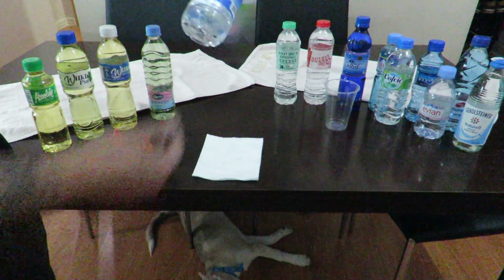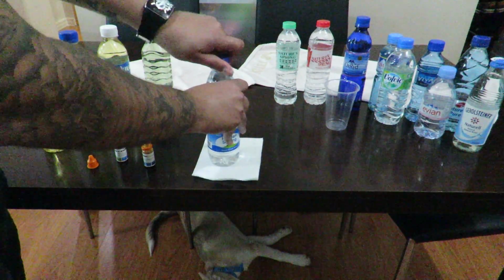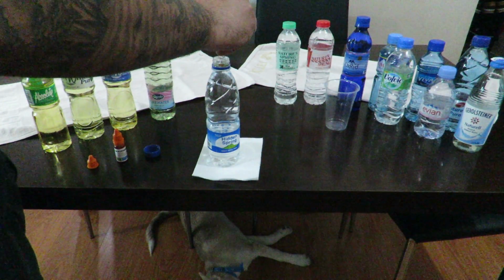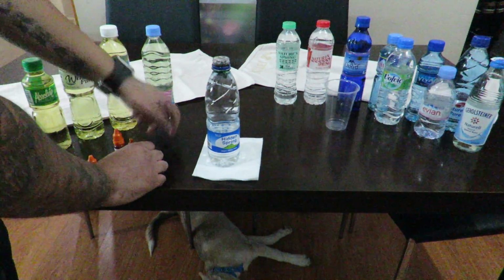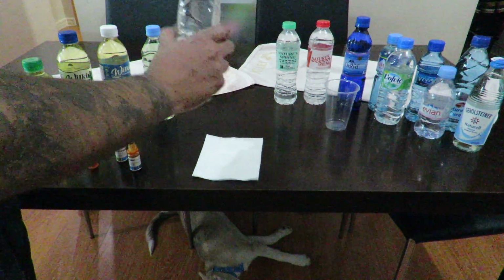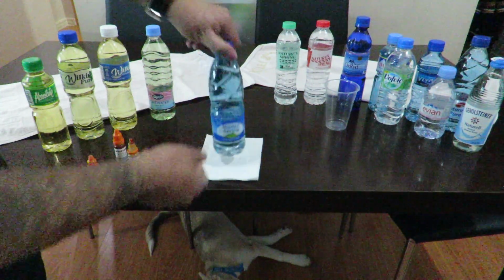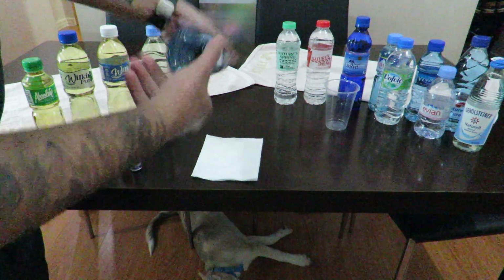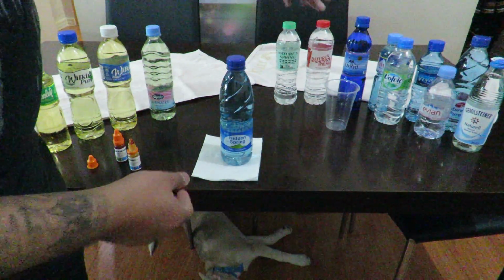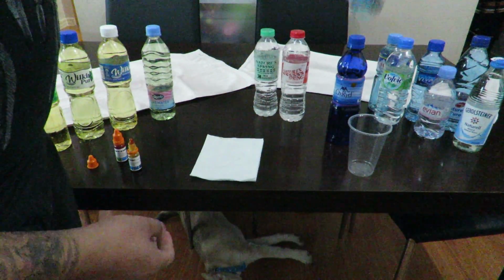And then our next is called Hidden Springs. It's a natural mineral water. Put some drops in. Obviously mineral water is better to drink than distilled or purified water, just from looking at what we're doing in this experiment. And so it's blue, and blue is good. And blue means that it's very good to drink. Gives you good qualities of water. Alright, and we'll put that over here.